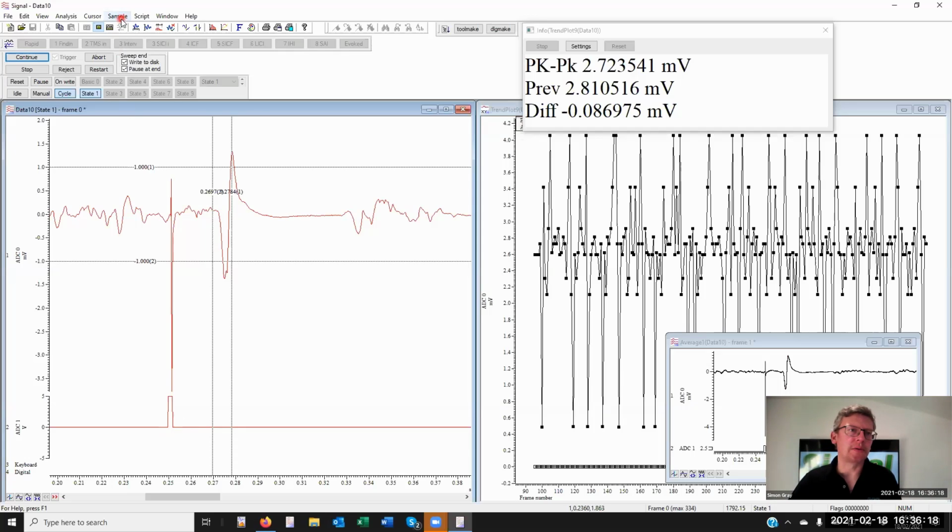So what I should have done within my sampling configuration, had I been able to get to it, is set the x-axis offset in the channels tab, general tab, of the sampling configuration to 0.25, which would reposition 0 for the next data frame. Now, recently, we've added a command, and it's just gone from my mind what it's called, but we are now able to realign the x-axis.